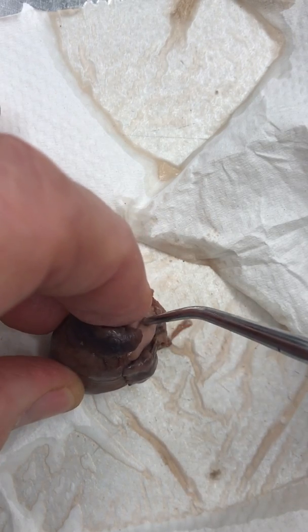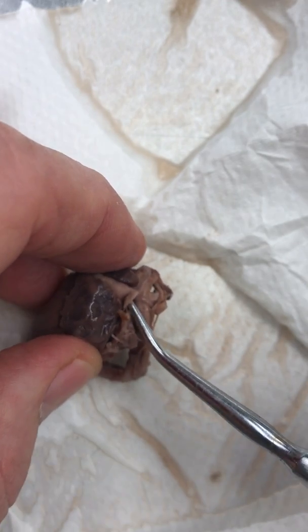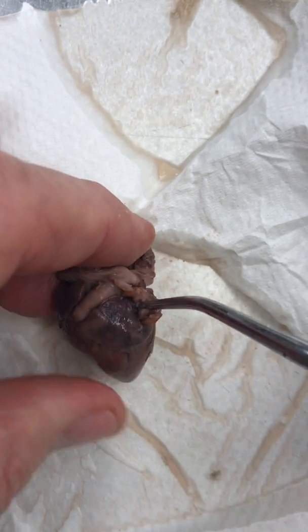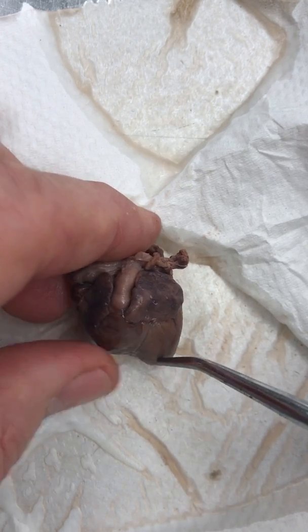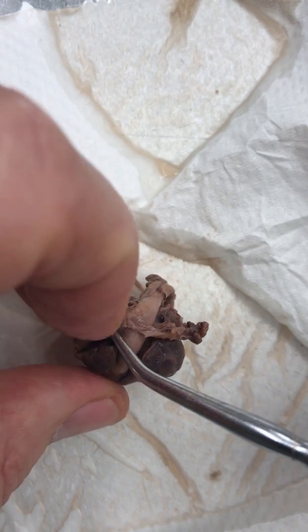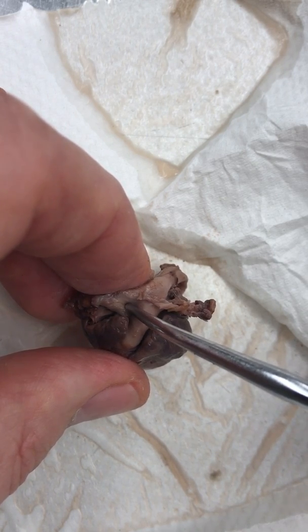So this is a pulmonary artery. This is taking blood into the lungs. So I've removed the lungs and kind of butchered the pulmonary system. But that takes blood to the lungs. Then it comes back through pulmonary veins into the left atria, left ventricle, big honking side of it, that pumps, and that sends blood out through the aorta. So this is the aorta coming out here on this backside. This is the pulmonary artery, and behind that, dorsal to that, is the aorta.